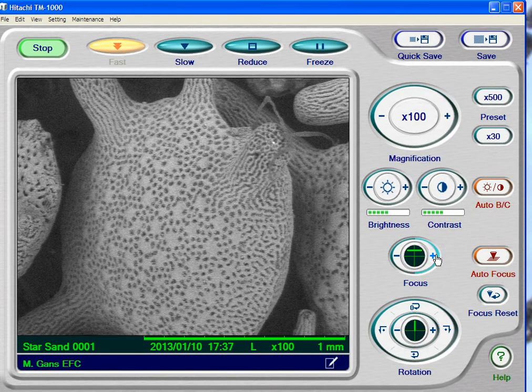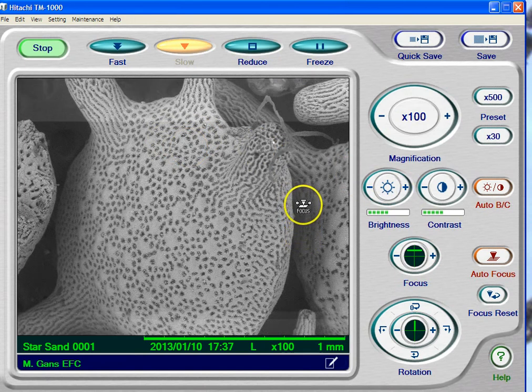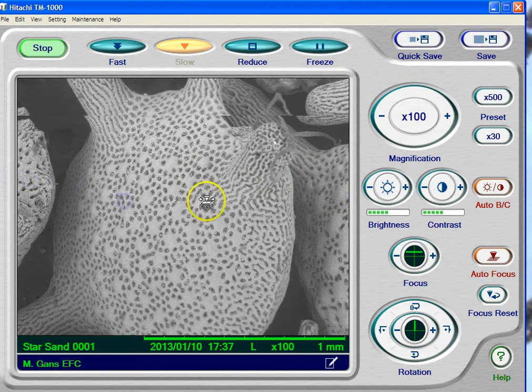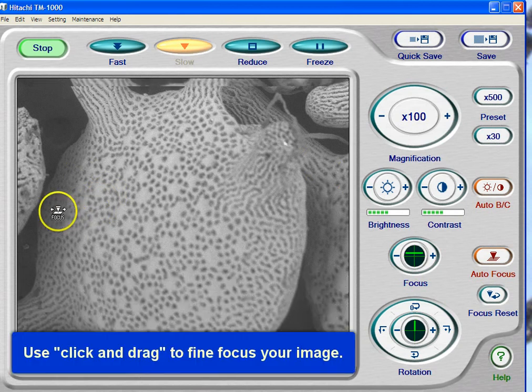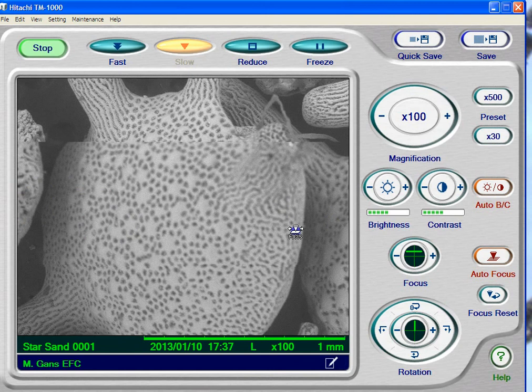Now let's say I want to focus manually, which is done a lot. Go to slow scan, because the image is much better quality on slow scan. When I hover in the screen, it actually says 'focus.' I'm going to hold the left mouse button down and drag across the screen — I'm basically just dragging right to left. As I do that enough, you can see I'm starting to throw the image out of focus. This is another way to focus — actually a really easy way to find focus. So I'm going to go back the other way, hold on the left-hand side and drag to the right, going until I get the picture that I actually want.